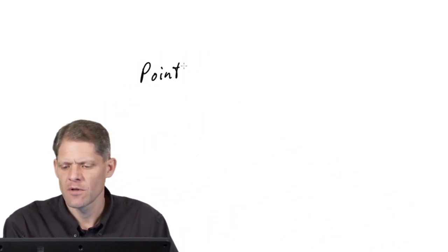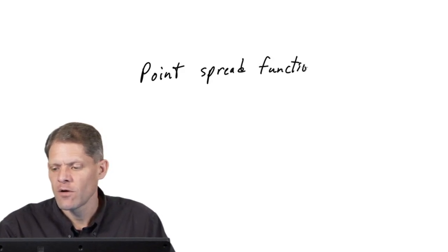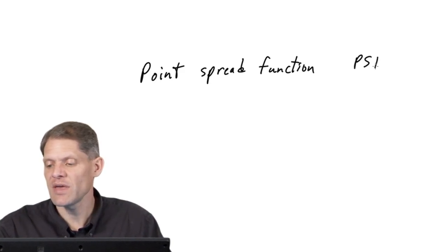Given that the contrast transfer function is like a very complicated bandpass filter, it's clear that EM images do not exactly reproduce the density distributions present in the sample. Instead, the images are blurred somewhat by missing and damped and sometimes inverted Fourier components. A term that we use to describe this blurring effect is the point spread function, or I'll abbreviate it as PSF.